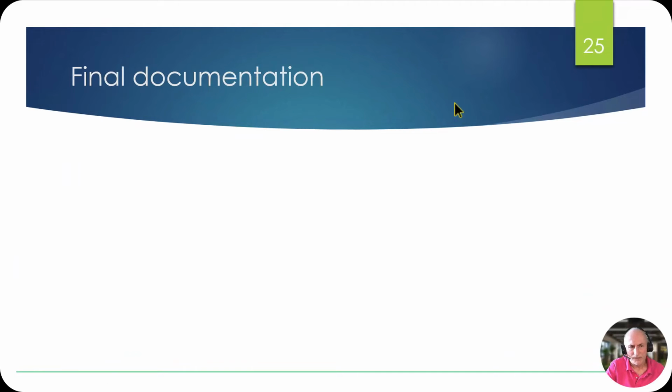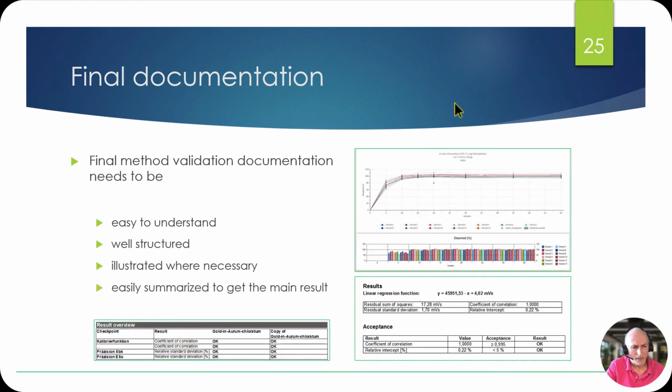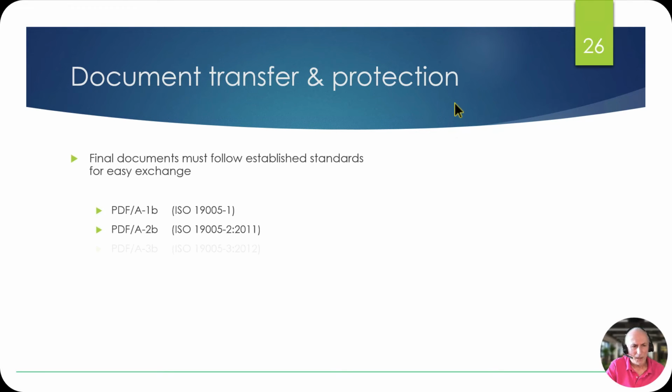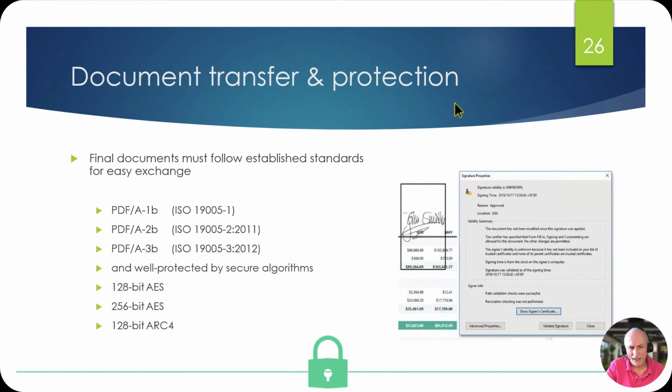Final documentation. Final method validation documentation needs to be easy to understand, well structured, illustrated where necessary, easily summarized to get the main result. Document transfer and protection. Final documents must follow established standards for easy exchange, like PDFA standard, and well protected by secure algorithms like AES encryption.